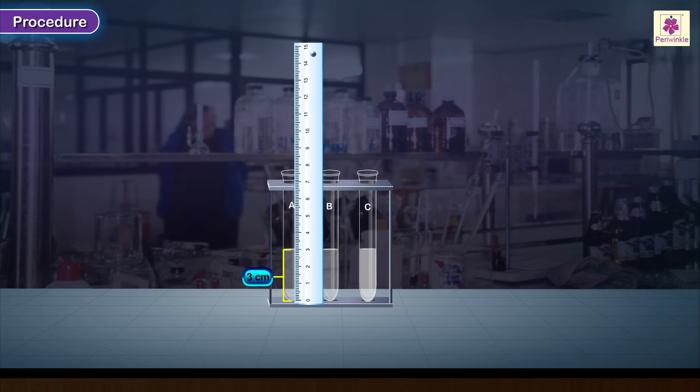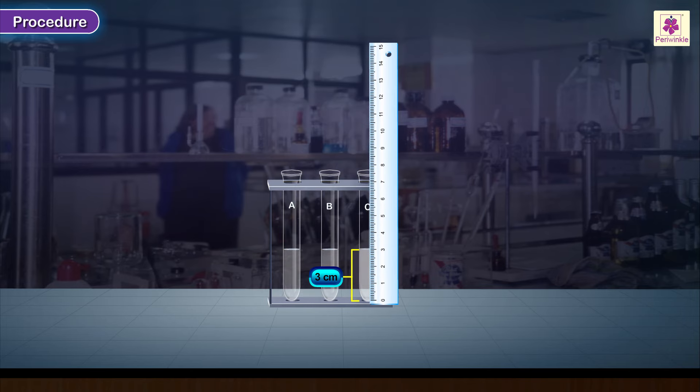Measure the length of solution in each test tube with a measuring scale.